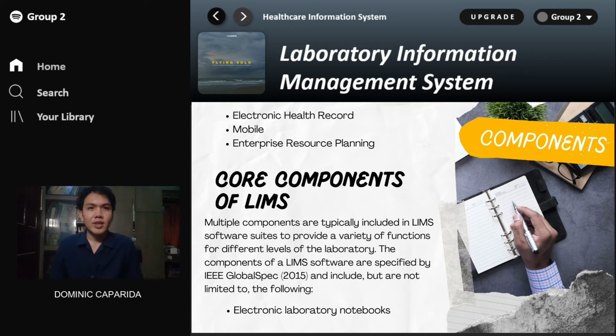They make it easier to manage data by allowing for data security, auditing, and collaboration. Some ELNs can also keep track of sample inventories, reagent inventories, and other supplies, as well as equipment and maintenance schedules.